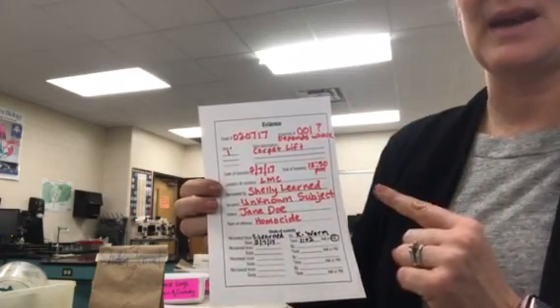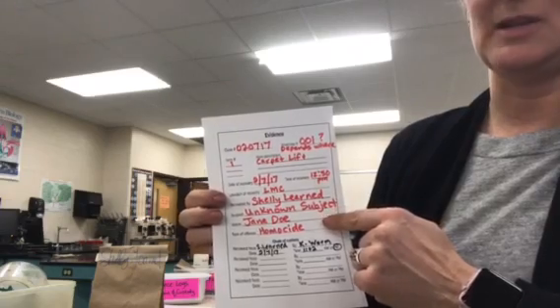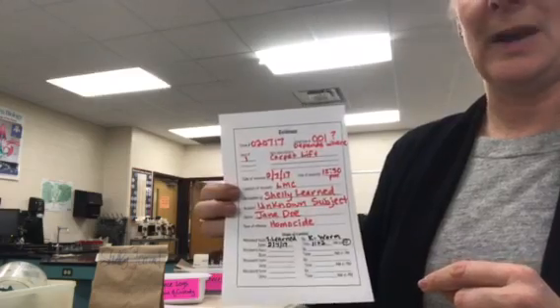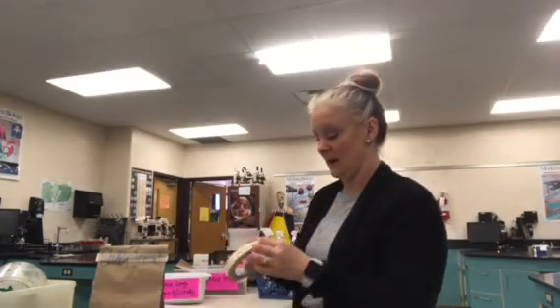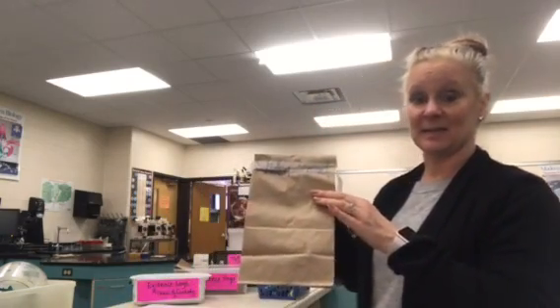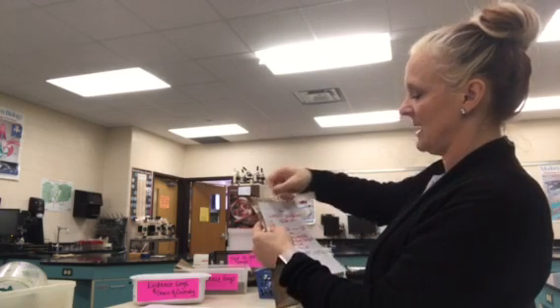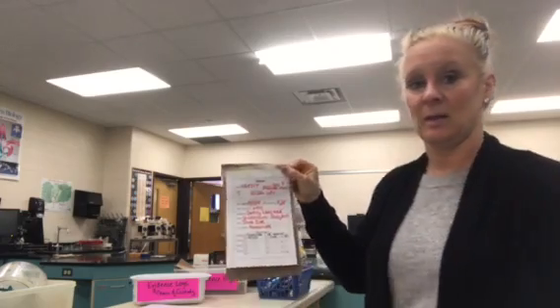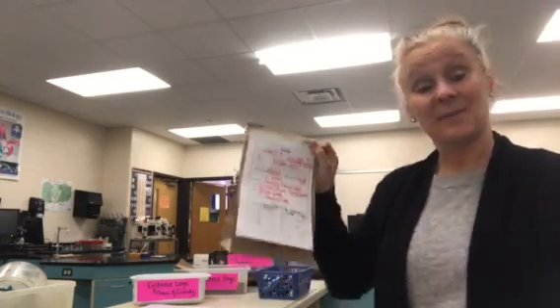And I would even come back to the video and record this information as best as I can before I even go out to do the carpet lift. That way it's all filled out and ready to go. Then all I have to do when I'm at my area or my space, if I'm at the LMC, I'm going to go ahead and flip my bag around from the side that I signed it on, and I'm going to replace that evidence label up here and keep that on the bag as well. Now my bag is labeled. At this point, I can come back to class, and then you're going to have to analyze your evidence.